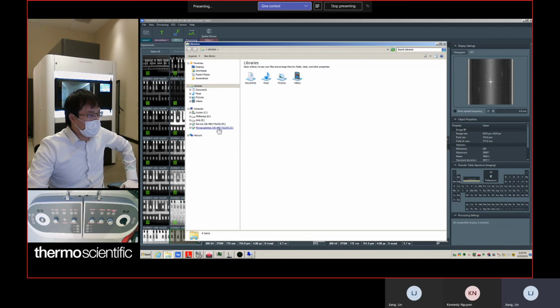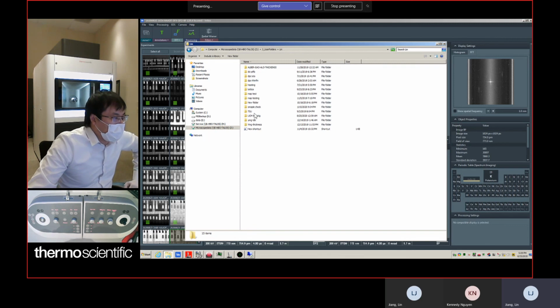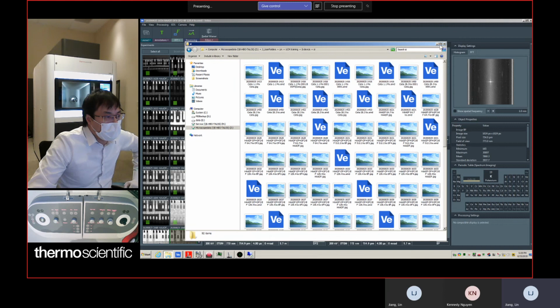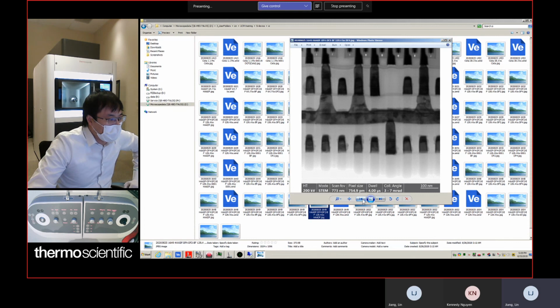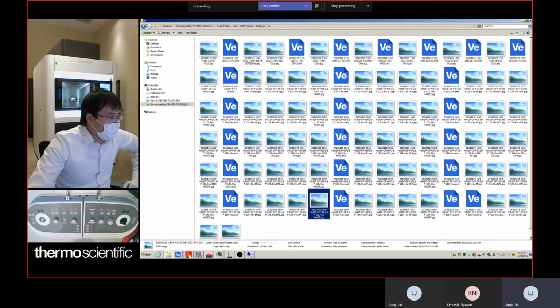Okay, let's take a look at the data. Save here, use folder. Okay, take one of them. Some don't have camera lens, and this one also has camera length. Okay, I got it. We might set that up.